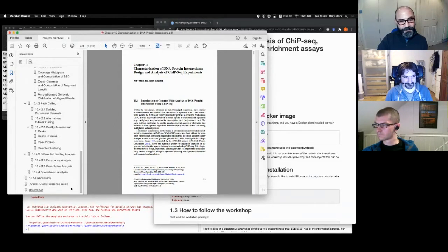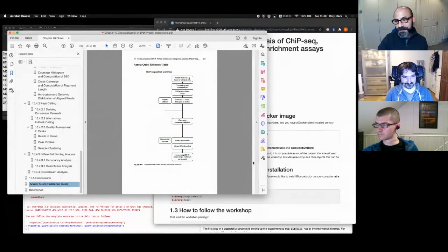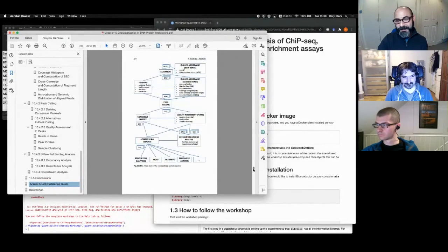I'm going to put up one picture, and this is kind of the picture that I use a lot, which is all the steps from after the experiment is run. And of course, the most important step isn't on here. It's in the chapter, I assure you, which is good design. You can't get a good analysis unless the experiment was properly designed.